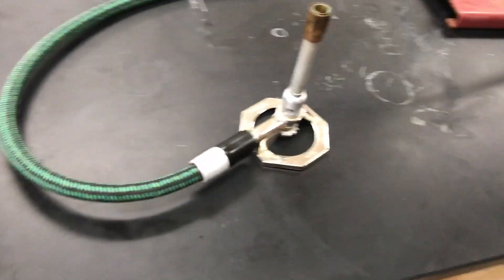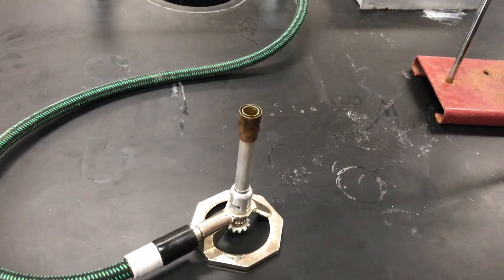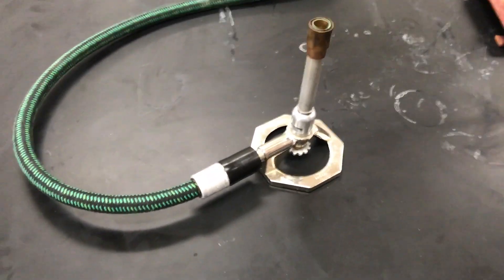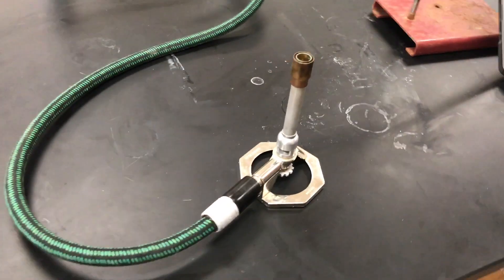It was the first stand to generate a hot, sootless, non-luminous flame by mixing the gas with air in a controlled fashion before combustion.